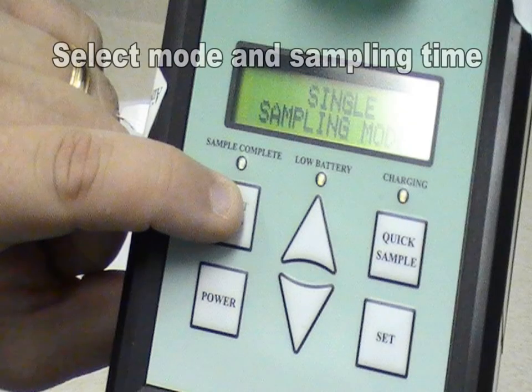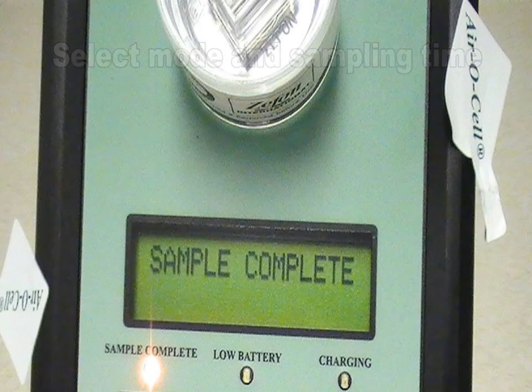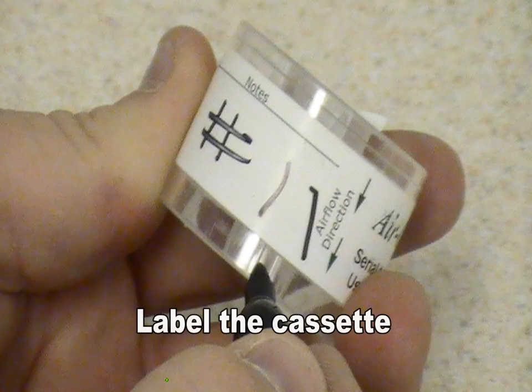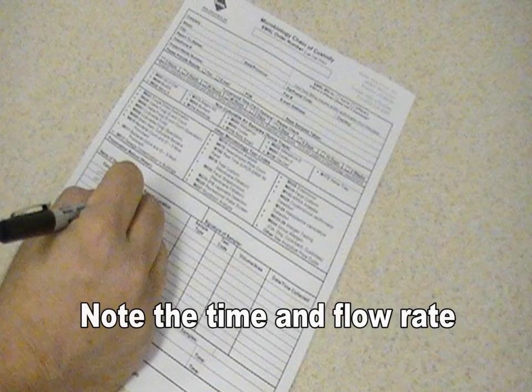Select the sampling mode and the sampling time. The pump will shut off after sample time is complete. At that point, replace the top sticky tab and remove the Air-O-Cell from the Biopump. Replace the bottom sticky tab and mark the cassette to correspond with the chain of custody.